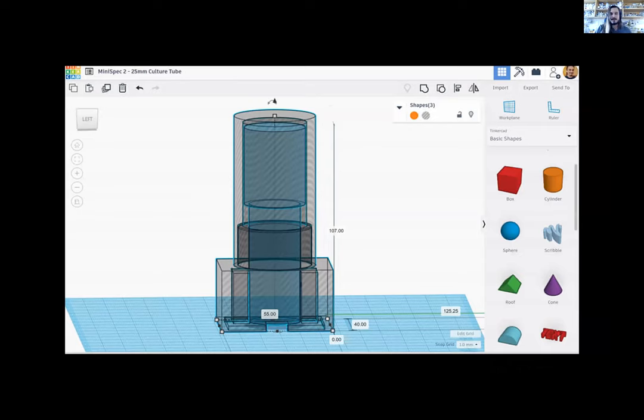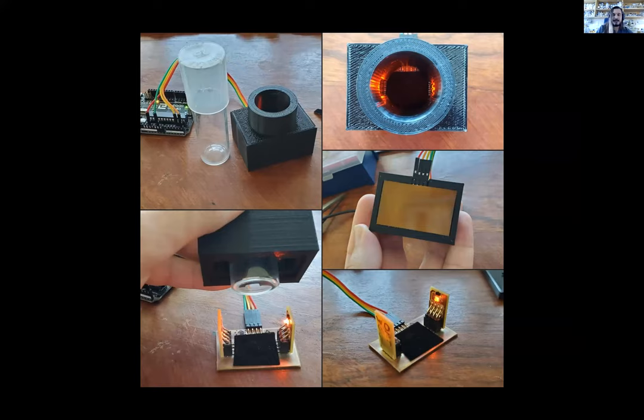And so I said, okay, there's these really cool orchid culture tubes, these plant tissue culture tubes that are 25 millimeter round and about 150 millimeter tall, and they have a cap that's vented, right? Kim caps. And so I designed a chassis around that and utilized the same exact light sensors for my single shot. And essentially built a modified version of the single shot that you can then throw into your shaker and allow it to actually read as it grows.